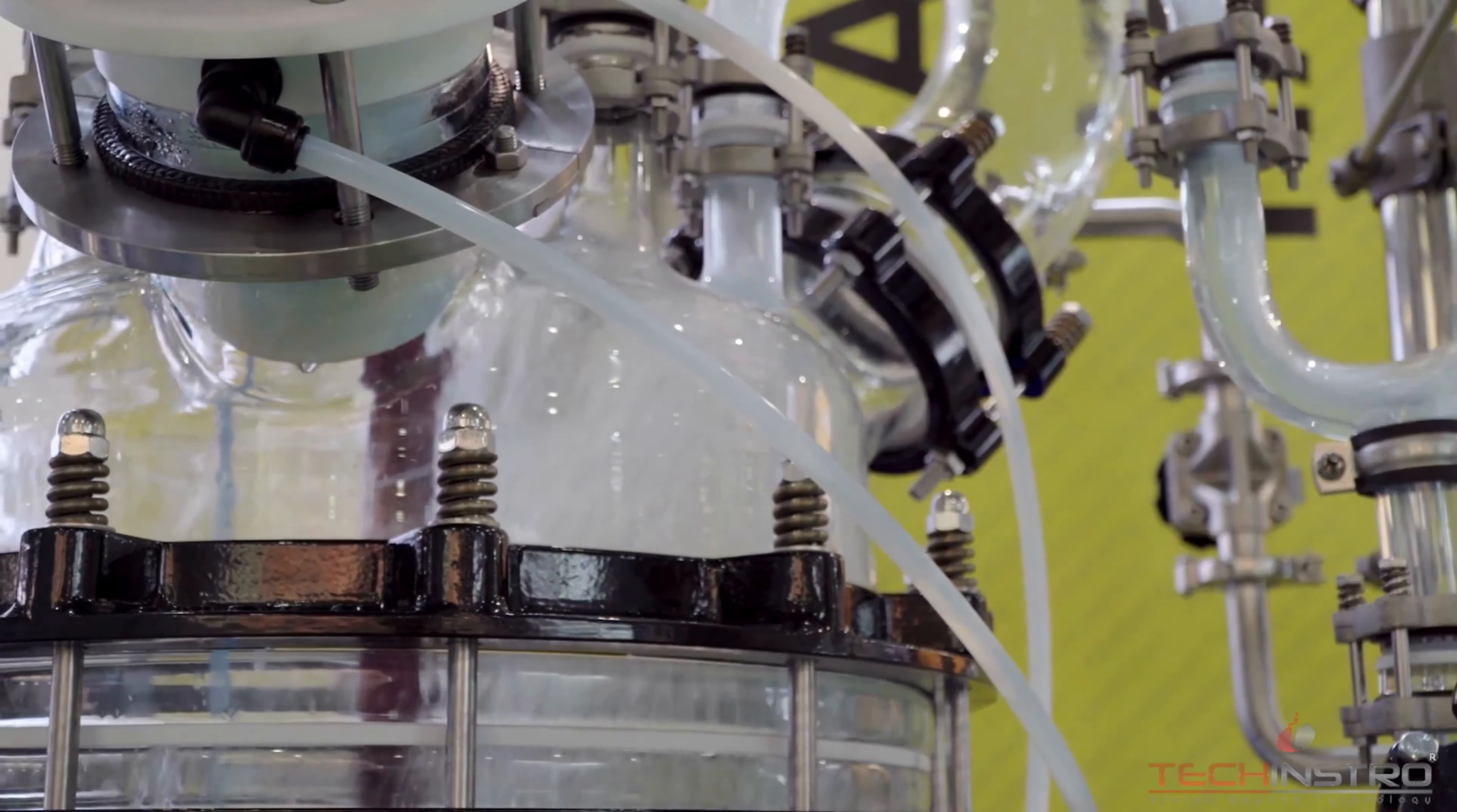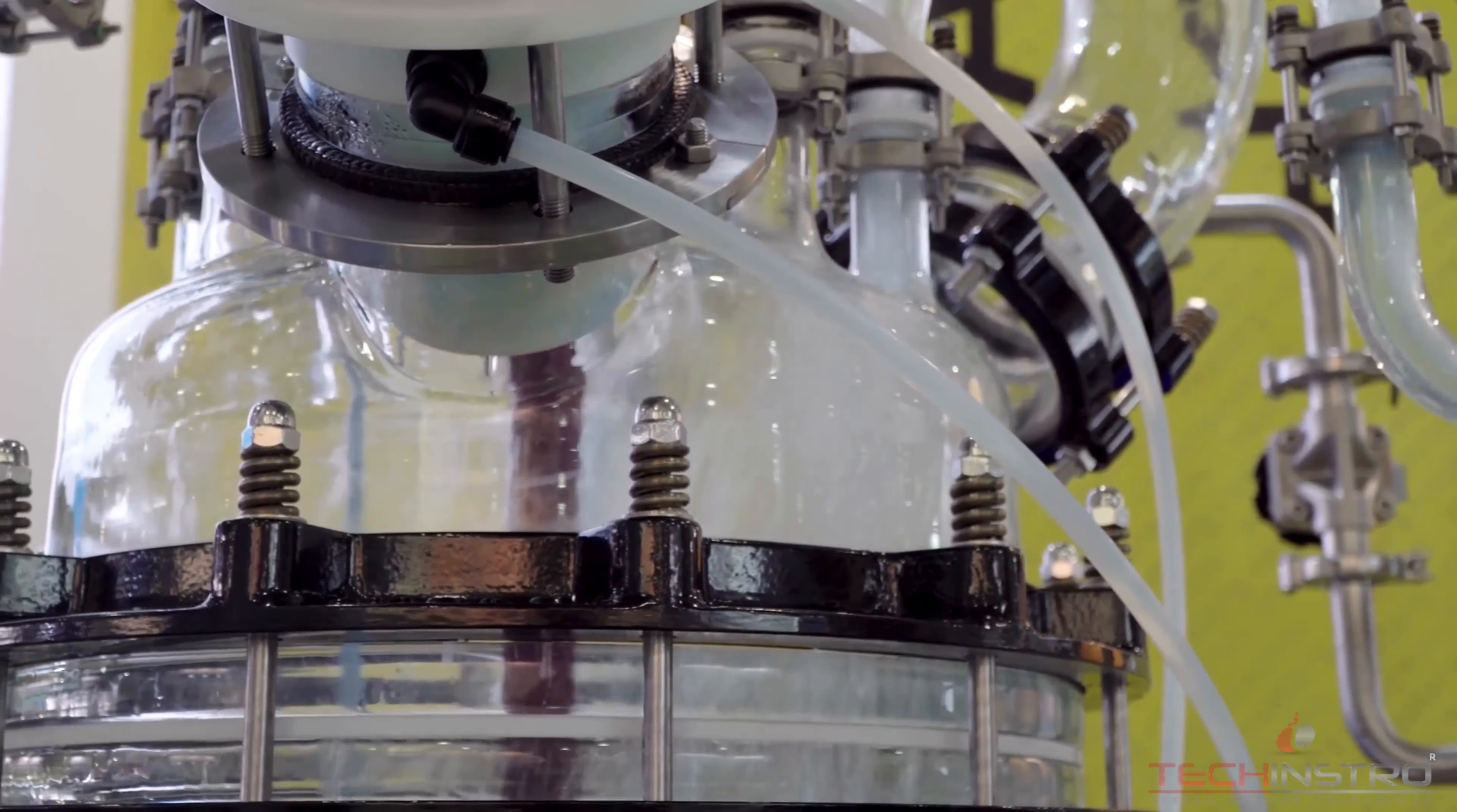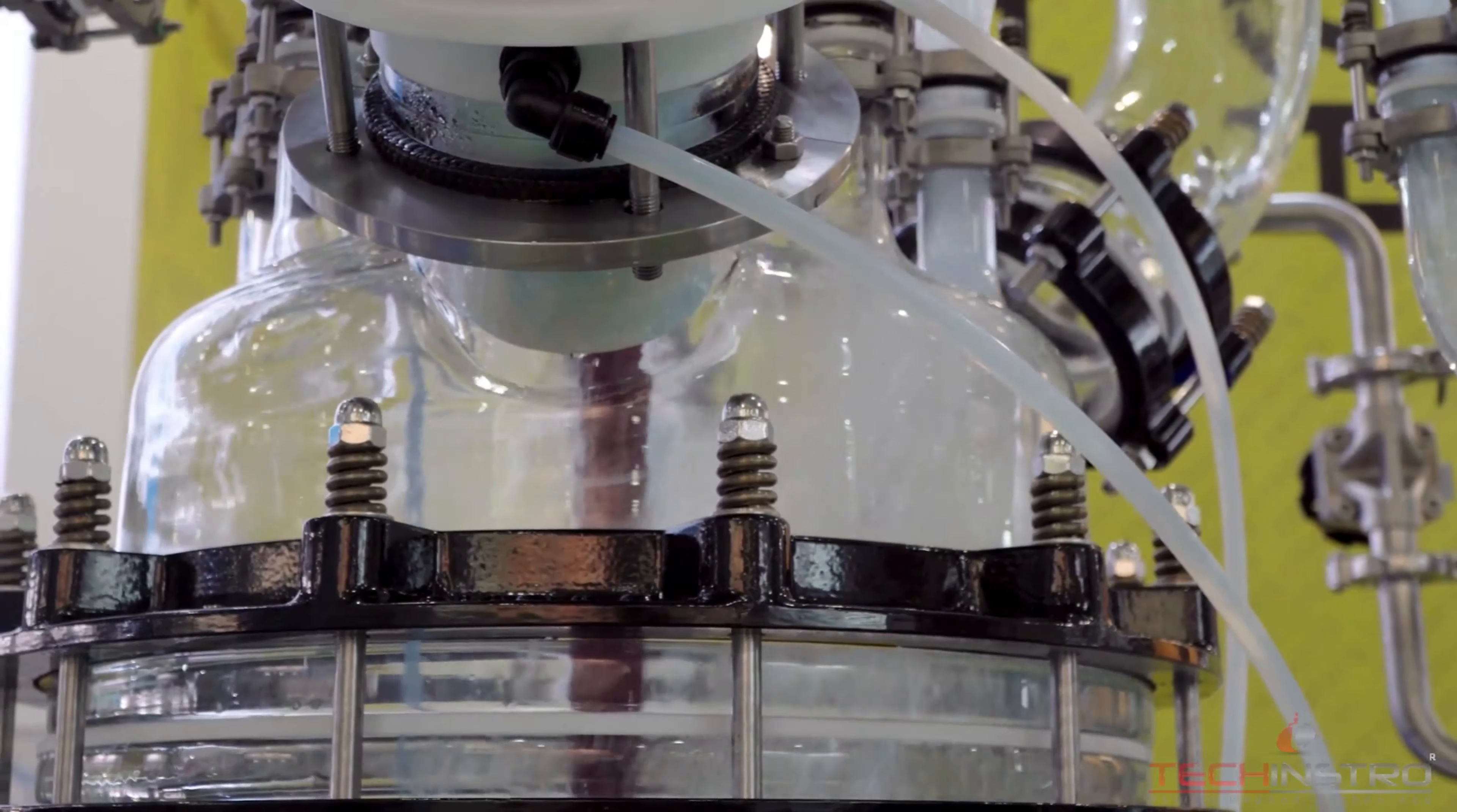The pressurization system of the reactor is equipped with systems to pressurize the contents within. This is achieved using a pressure source such as compressed gases or hydraulic systems. The pressure is increased to the level required for the specific chemical reaction. Pressures can range from a few hundred to several thousand psi (pounds per square inch) depending on the application.